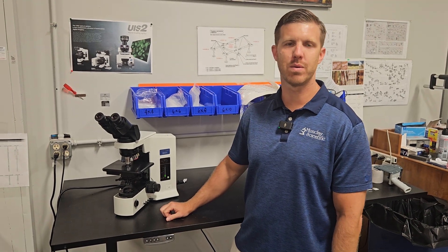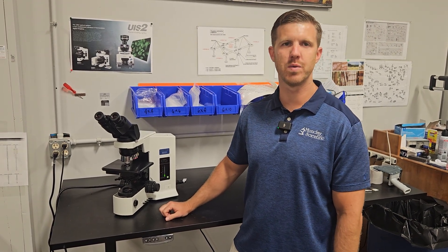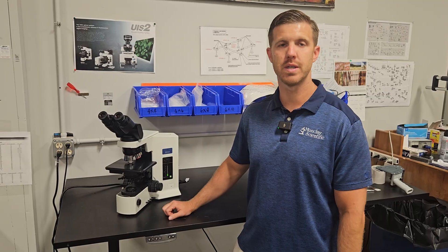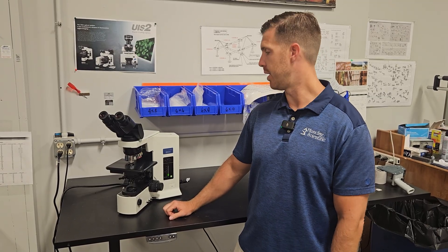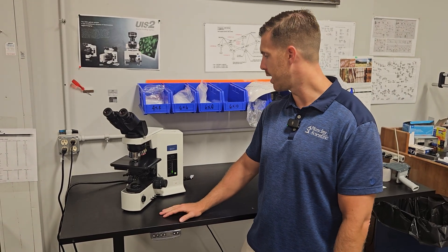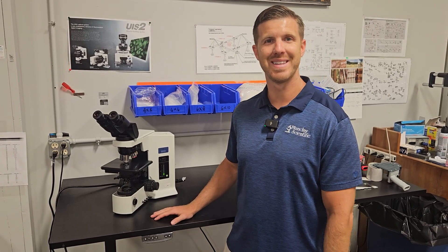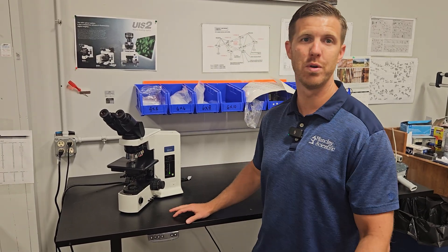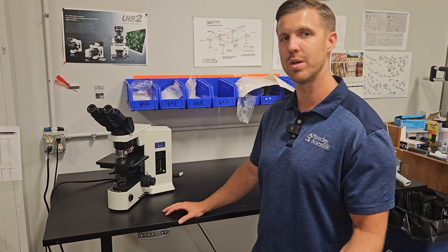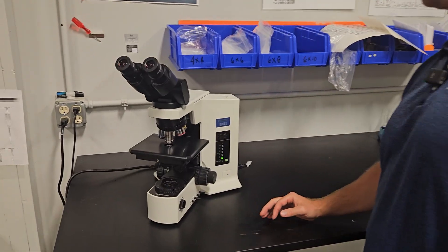Hey, this is Chad with Monday Scientific. Today we're going to talk to you about an Olympus BX51. This particular 51 is set up for a pathologist and Mohs surgeon. We're getting ready to deliver it next week, so we wanted to do a demo that'll help them and anyone watching this video go through your microscope. So Michael's going to come in and we're going to talk about it.